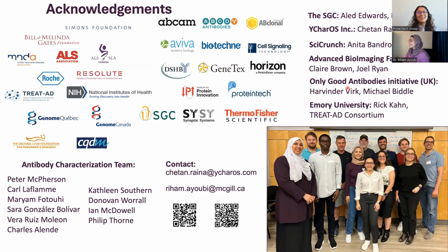Thank you so much. The next question is a question about one of your slides. So it says on slide 39, how long was the denaturation each? I used to boil the samples at 95 degrees Celsius for 5 minutes in SDS loading dye. On this slide, it seems to already be aggregating.